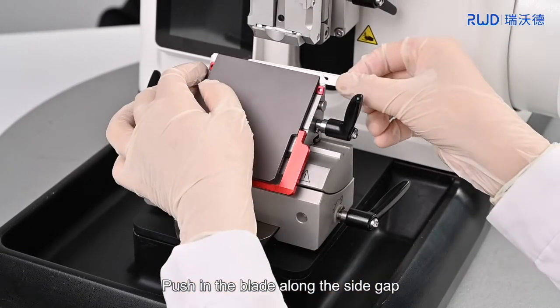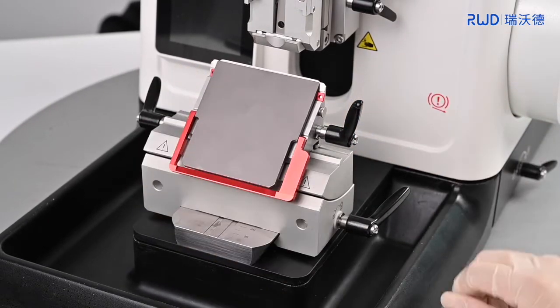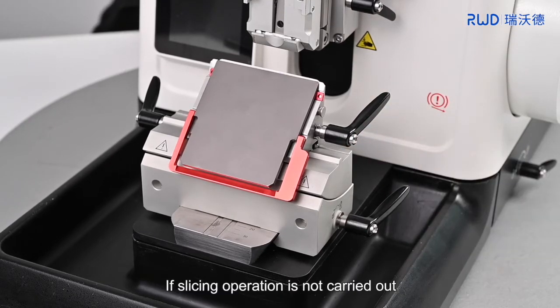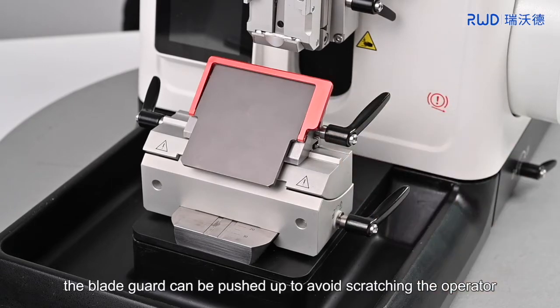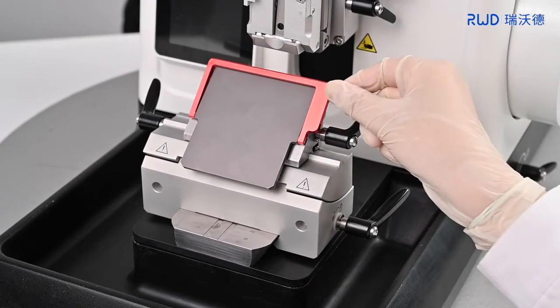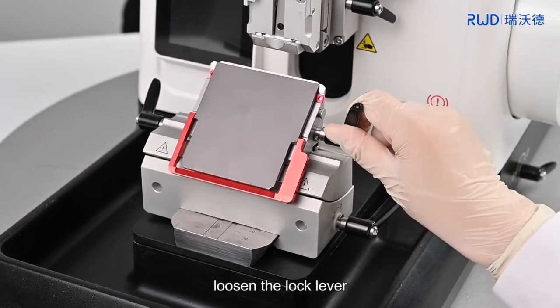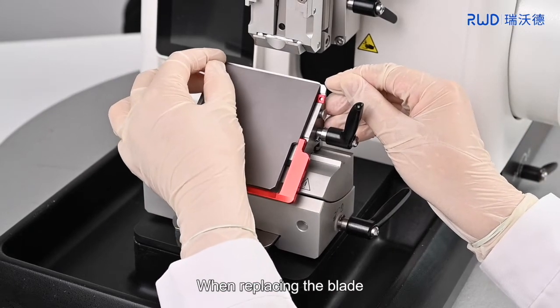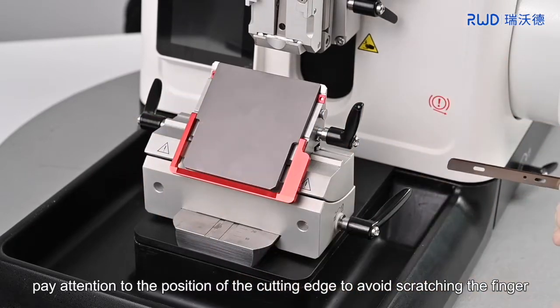Once installed, push in the blade along the side gap, screw the lock lever and fix the blade. If slicing operation is not carried out, the blade guard can be pushed up to avoid scratching the operator. To remove the blade, put down the blade guard, loosen the lock lever, and take out the blade. When replacing the blade, pay attention to the position of the cutting edge to avoid scratching the finger.